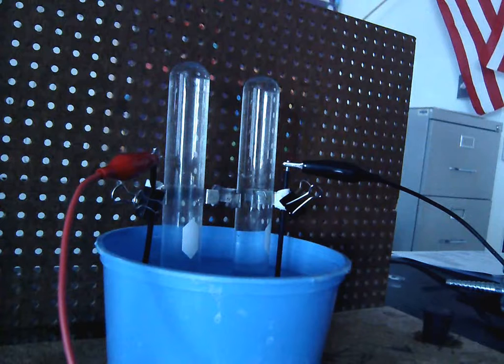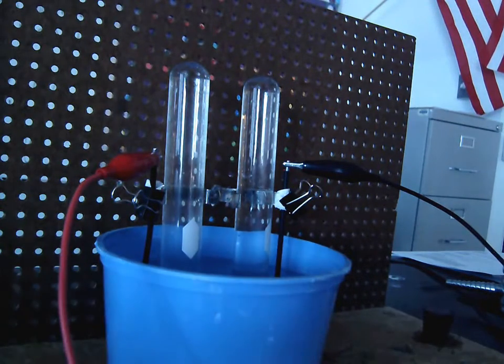So we're going to take the water, separate it into hydrogen and oxygen, and then measure it. And we're going to say, well, how much of the water was hydrogen and how much was oxygen? And we're going to be able to compare the volume and the mass ratios of hydrogen to oxygen. So that's the end goal here. But in order to get there, it's probably worth understanding the process at least a little bit. So let's take a look at what we have here.